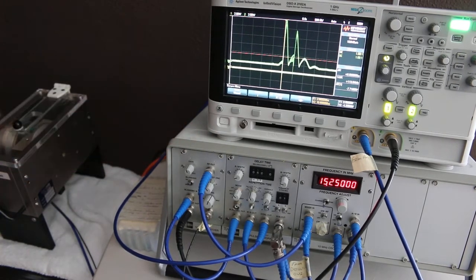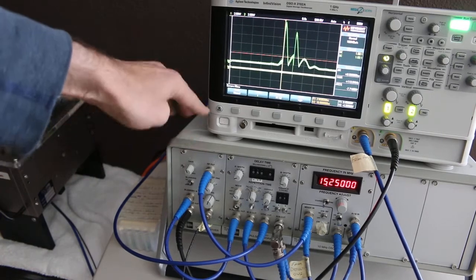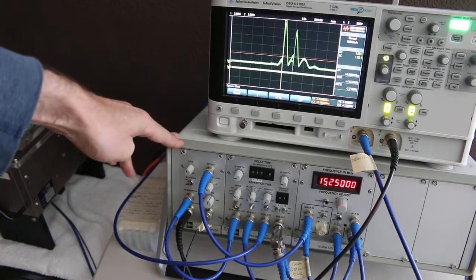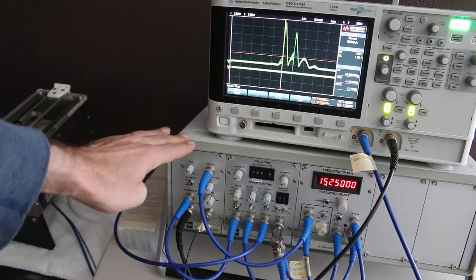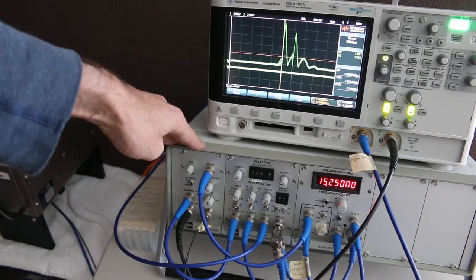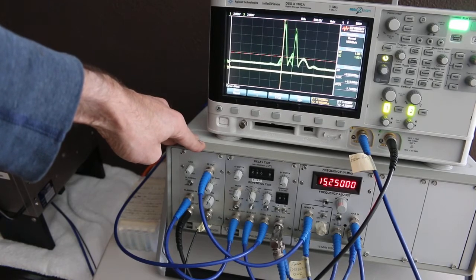It can basically take in signals from the sample over here into the receiver, do some amplification. There's a gain knob right here. There's an RF out. There's an RF in and a few other things. That's sort of what a 15 megahertz receiver does and is for in this experiment.